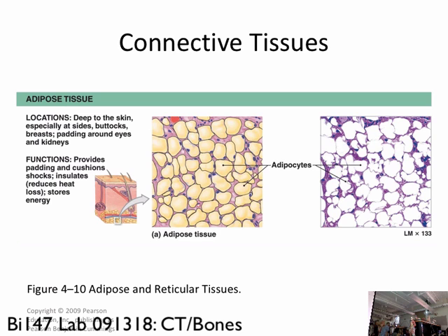So, in our lab practical, will we pull up and show you each? No. What would happen, and I'm not promising, but I'll probably have a couple slides at least, is the slide will be set up, and there'll be a pointer. Some of your scopes have pointers on them. There'll be a pointer pointing to a structure, and there'll be a card that says, what is this thing? What's at the end of the pointer, or name this cell type, or what's the structure at the pointer. The only things you're going to be responsible for are identifying the tissue type and any of the structures that are listed on that list underneath those tissue types. Does that make sense? Yeah, so I've pared it down. This is very focused anatomy. The body's a lot bigger than what we're exploring, but this is just the stuff that's relevant.